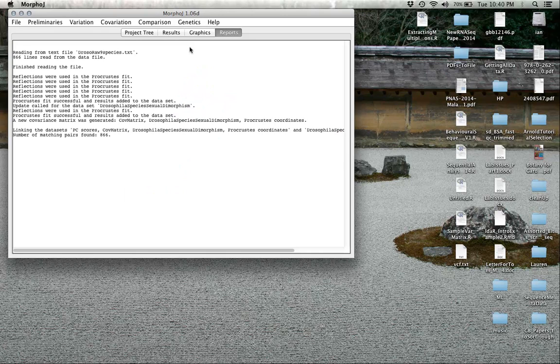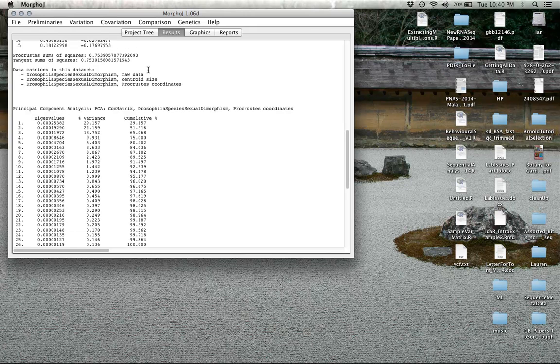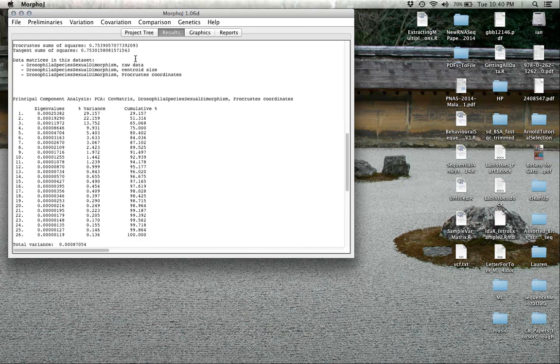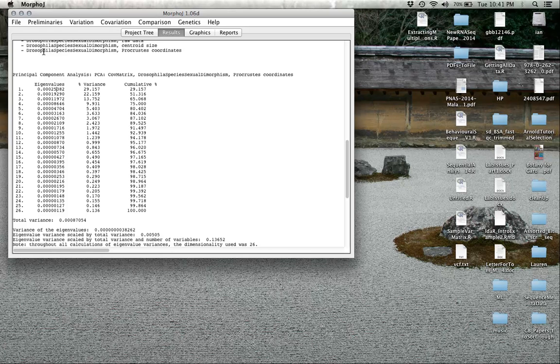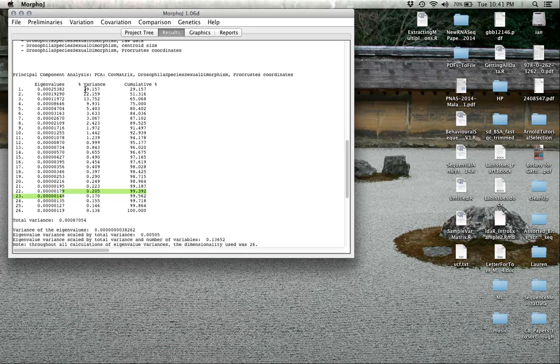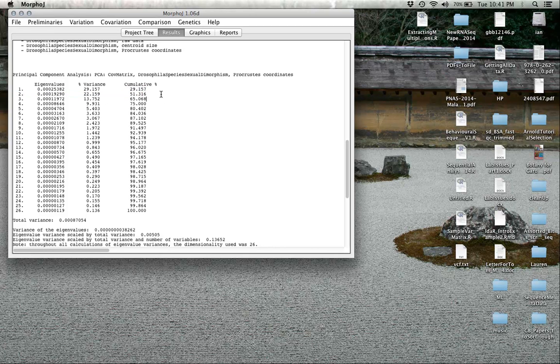The last thing we'll talk about is looking at the results section. It has the principal components analysis. This tells you the magnitude of each of the eigenvalues associated with the principal components. This first eigenvalue represents almost 30% of all the variation. The next one would be 22% and so on. You can look in this last column at the cumulative ones. The first five principal components explain over 80% of the variation.